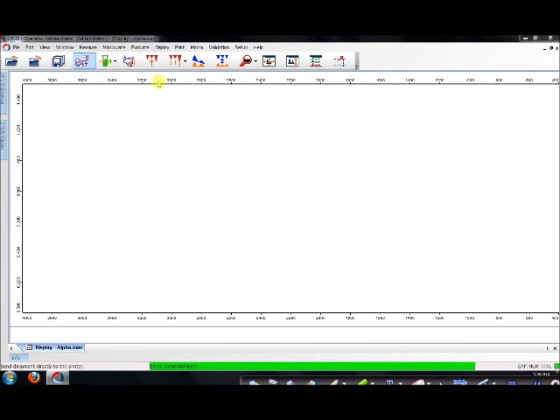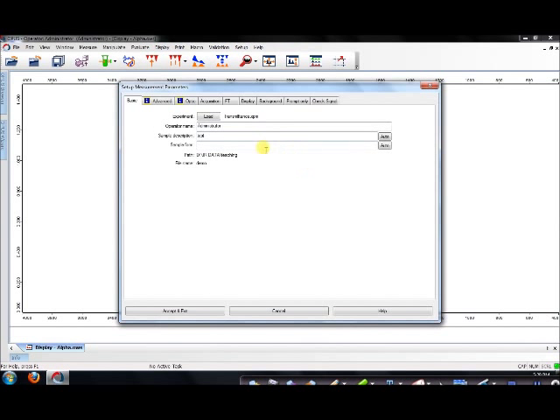Click on the tab Measure, and then set up measurement parameters. At the sample description, key in the name of the sample that you're going to test for. You can go on to the next tab.